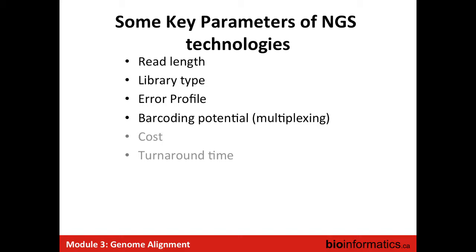I need per sample. Do I need to barcode my samples or not? Because we know that barcoding is cool, but it could also imply some bias in your data. We know that recently they have talked about index switching and everything.